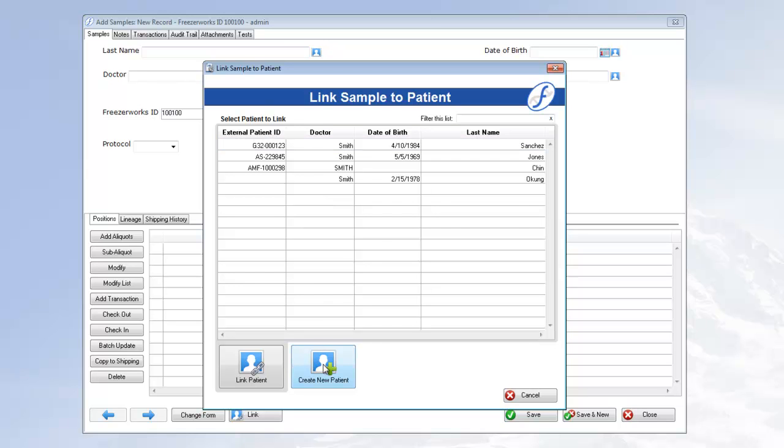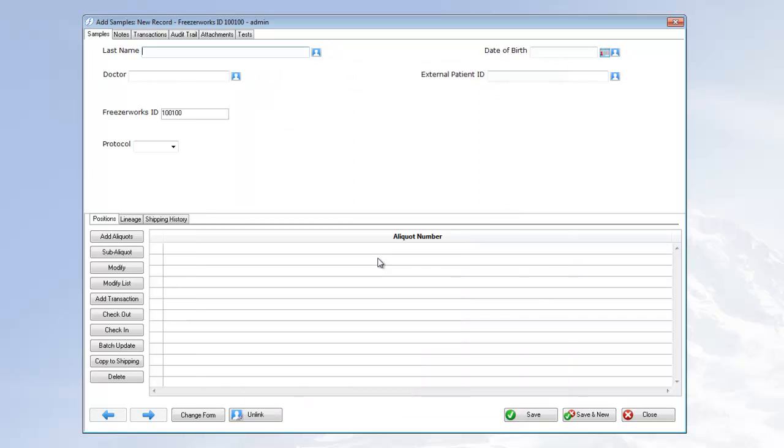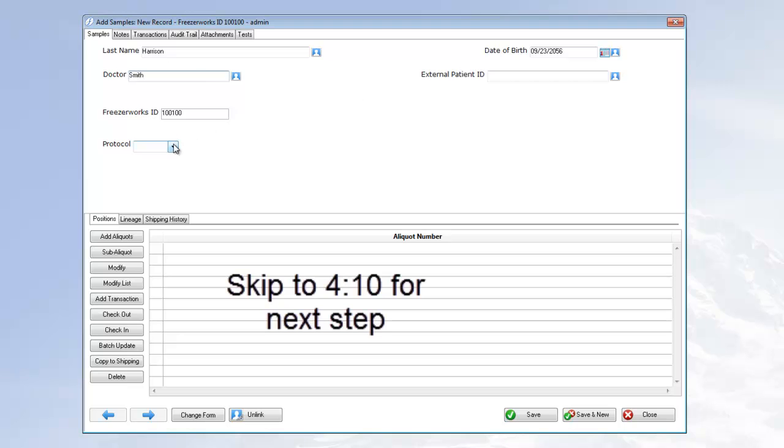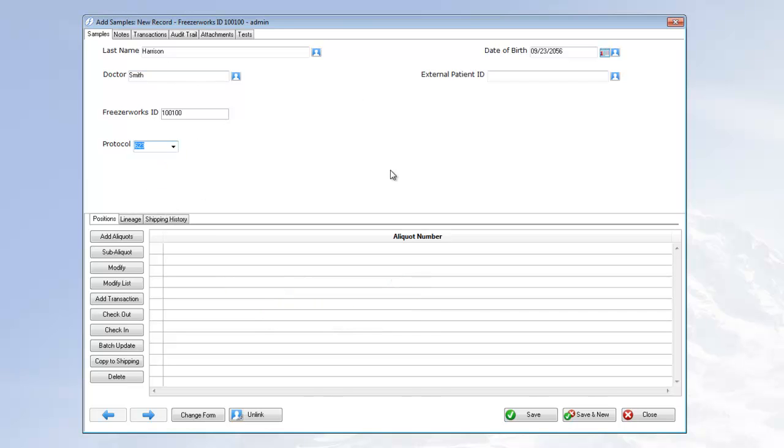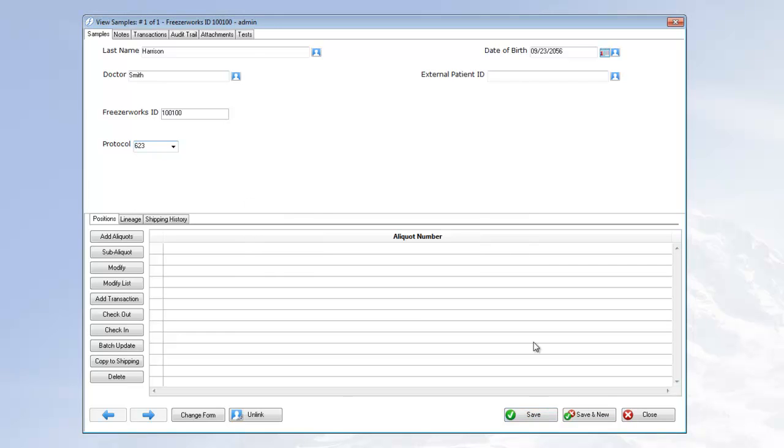If you choose to create one, you will then need to enter all the patient data manually. But all of this data will be automatically linked to the new patient record. Once you're finished, save and close the record to return to the landing page list view.